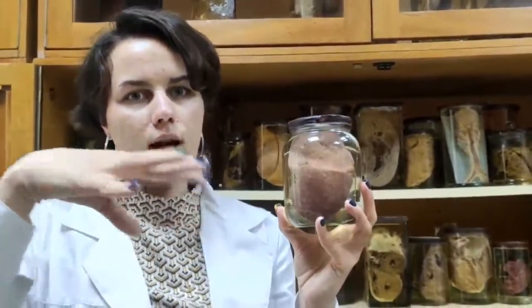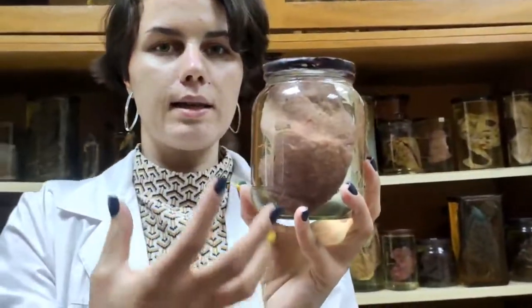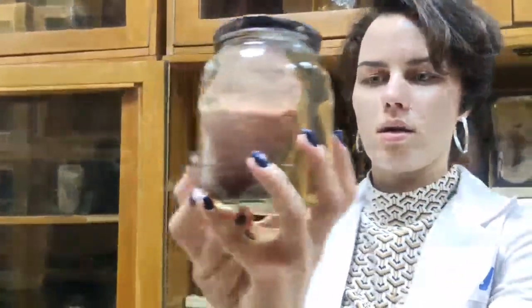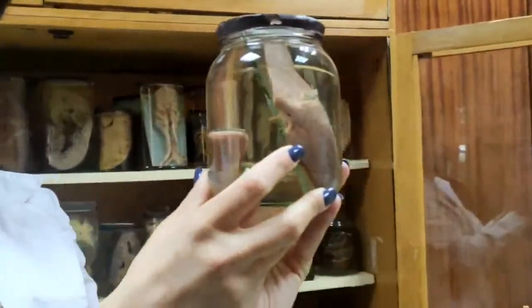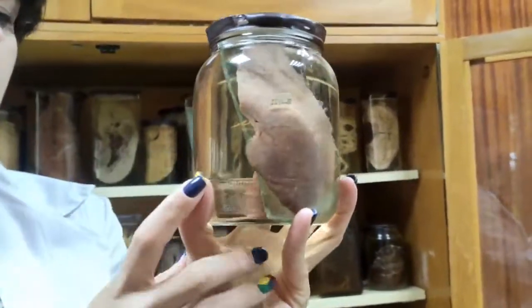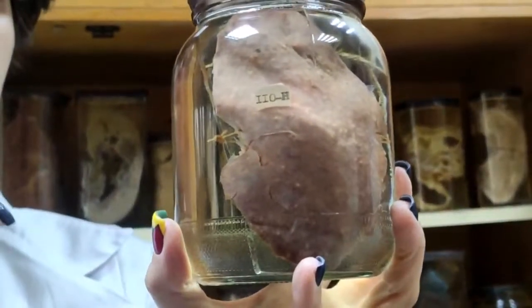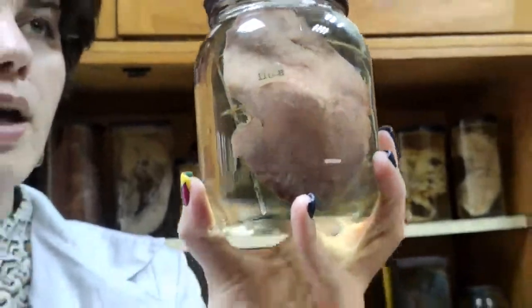We will see a lot of scars on the surface. But here you just see that the kidney is enlarged. You can see edema and a lot of small nodules, which contain a lot of pus. Under the microscope, pus consists of neutrophils, and these are small microabscesses in the cortex.